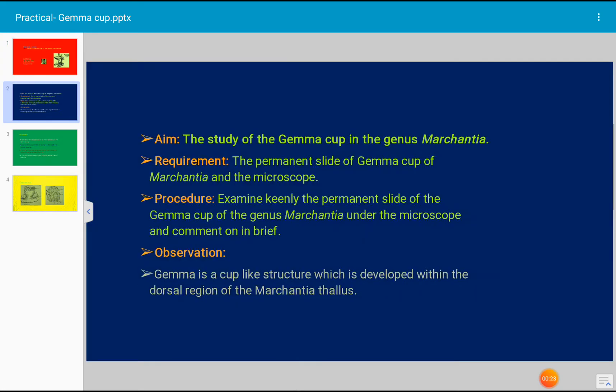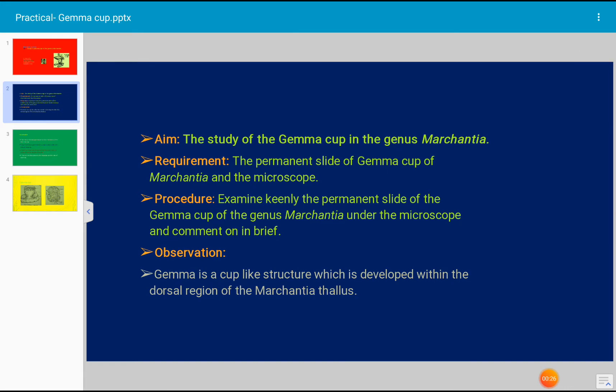Requirement of the practical: we need a permanent slide of gemma cup of Marchantia and we need a microscope to observe the slide.